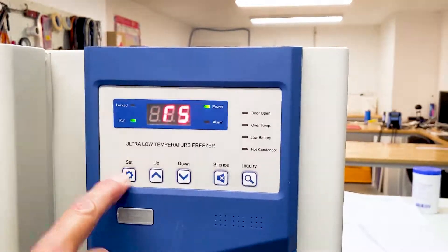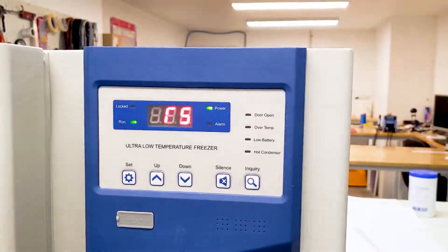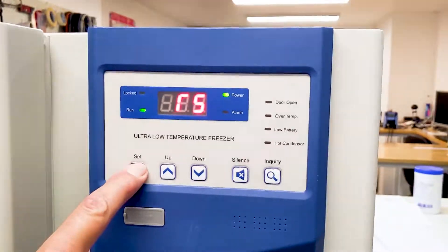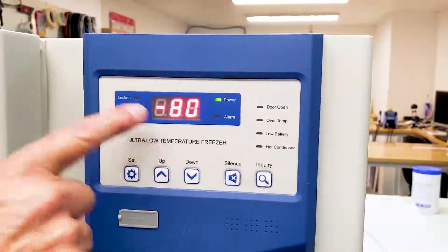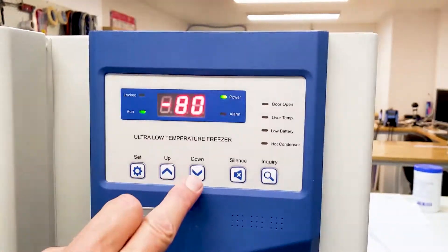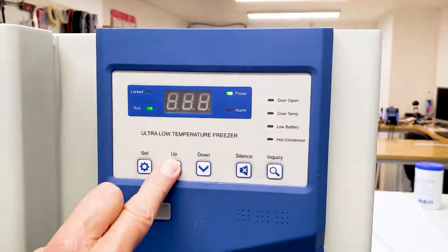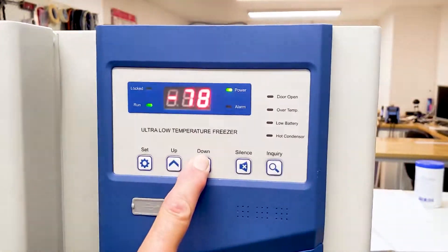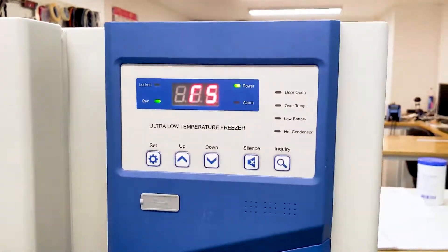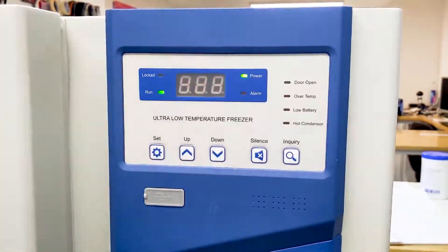If I press set again we'll get the RS indicated there, which is the real setting it is set on. If we press that again we can see it's now flashing to show it's at minus 80 degrees, and that's the setting we're trying to achieve. You can adjust it upwards or downwards if you want — for example, to leave it at minus 78. You just press the set button and that will lock it into that position.